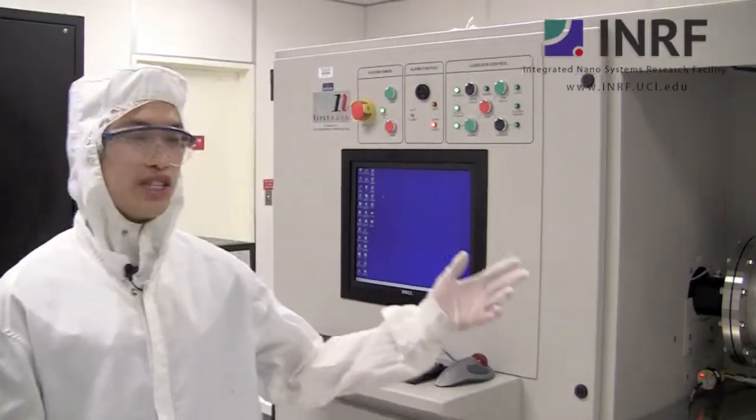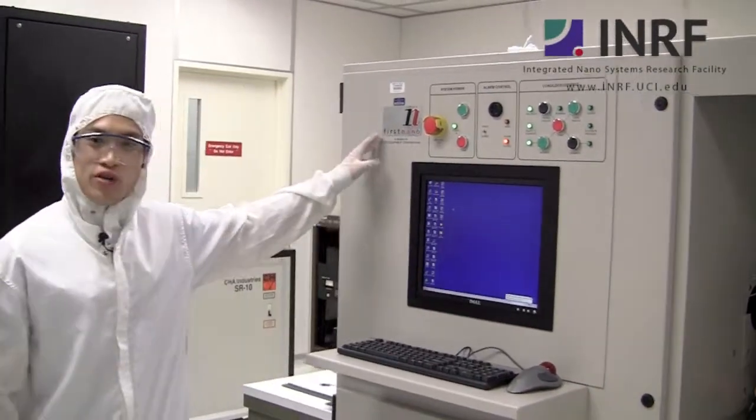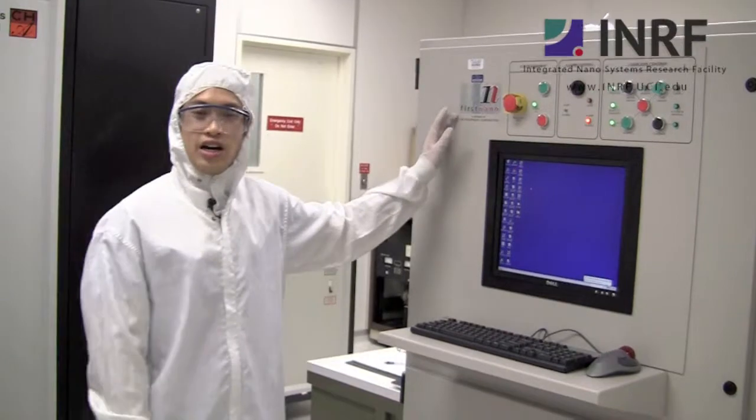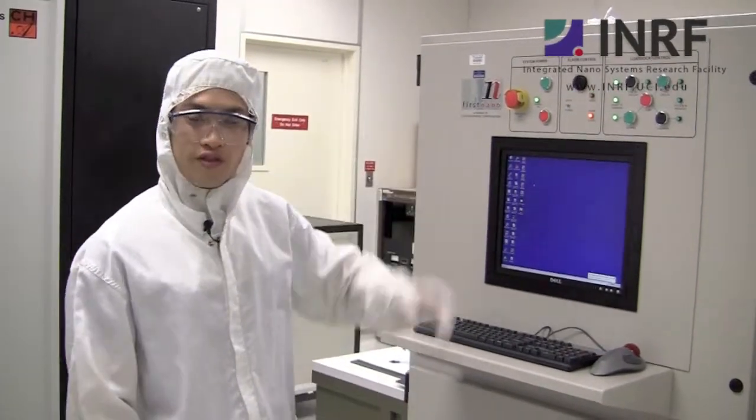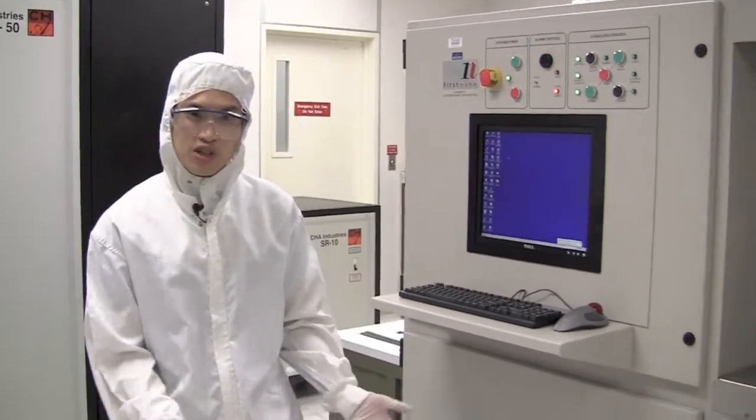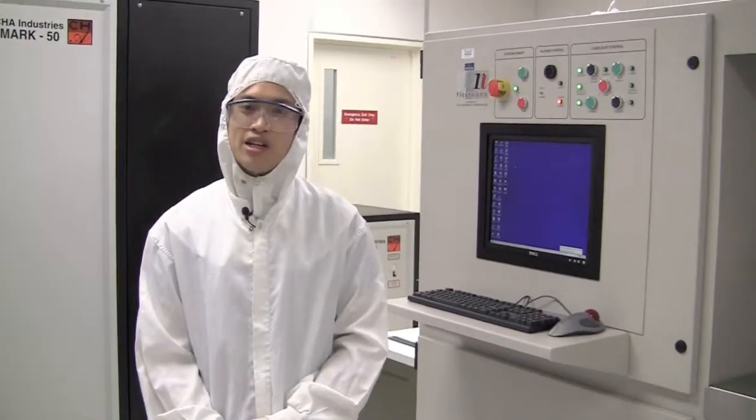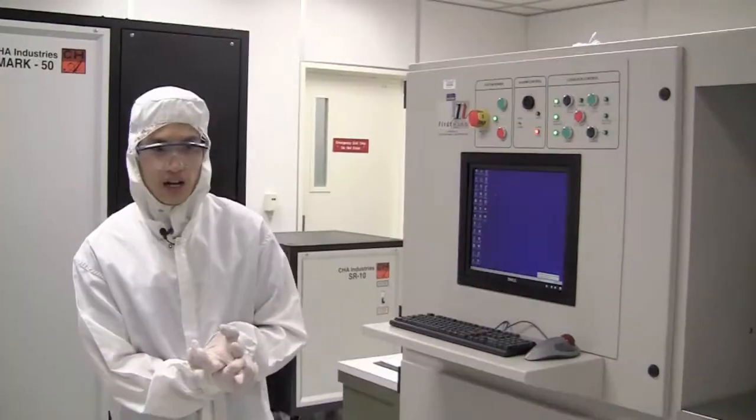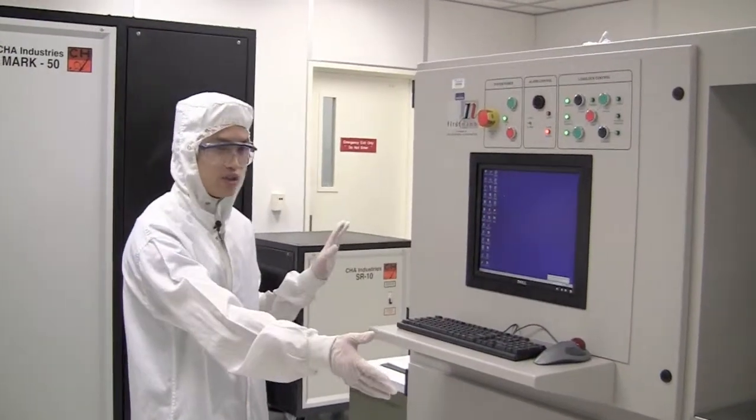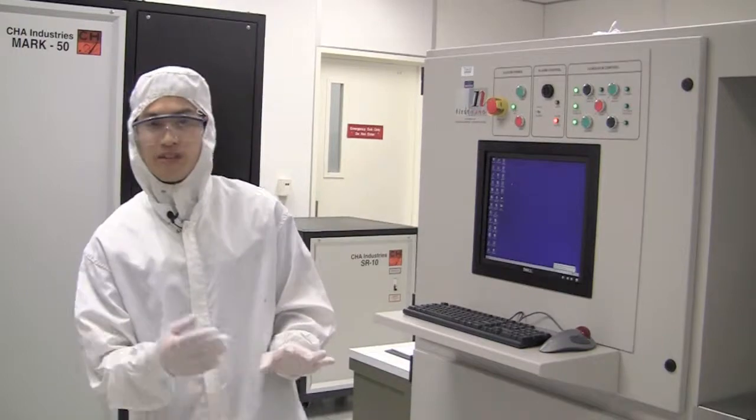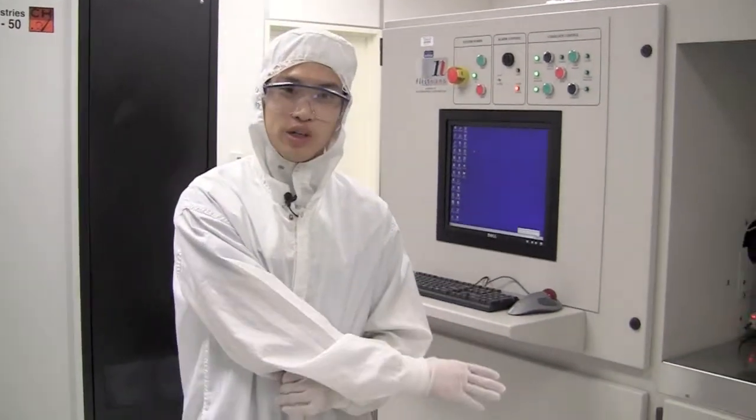Hi, my name is Phi Pham. Today I'm going to talk to you about the first nano CVD furnace. This furnace is used for synthesis of materials such as graphene and carbon nanotubes, but we can also use it for processing such as vacuum annealing. I'm going to talk about the general layout of the tool and specifically how to safely operate it.